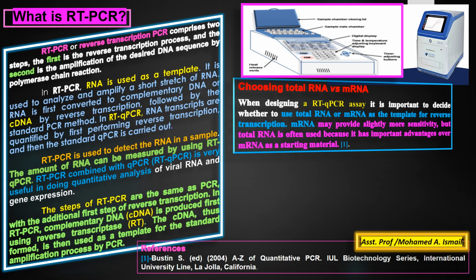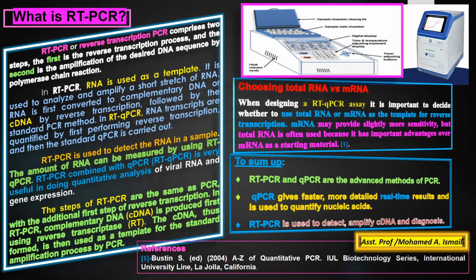To sum up, RT-PCR and qPCR are the advanced methods of PCR.